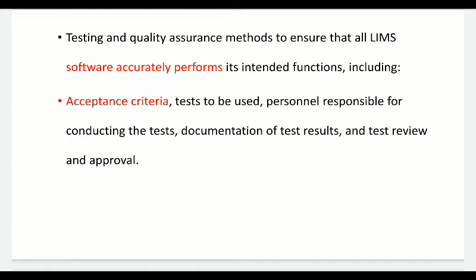Throughout the validation, we have to prepare a proper document on who is doing the validation, what the findings are, and whether the software is performing properly or not. All this information we have to document, and on successful validation, the person conducting validation will give the final approval for the use of LIMS software.